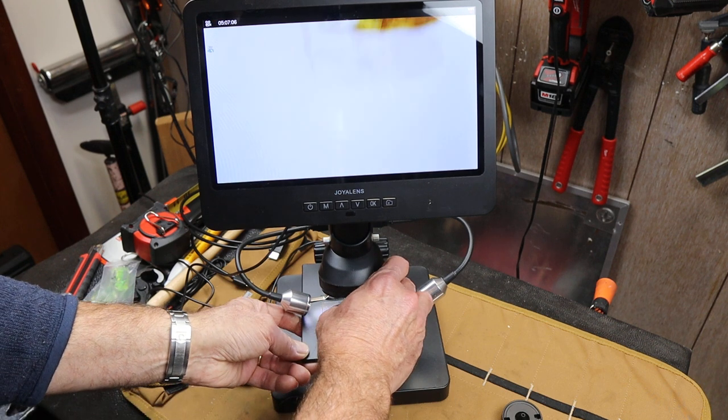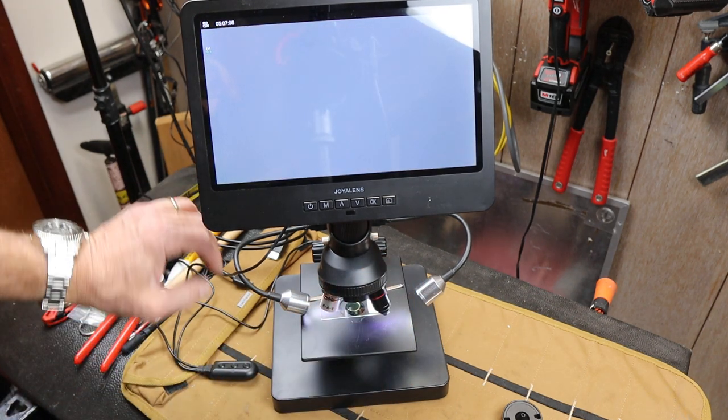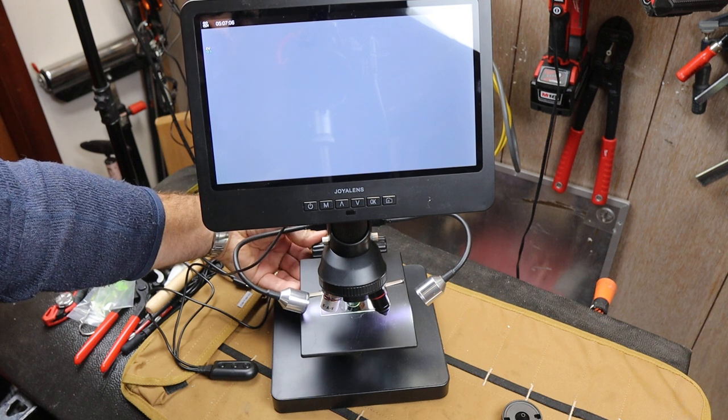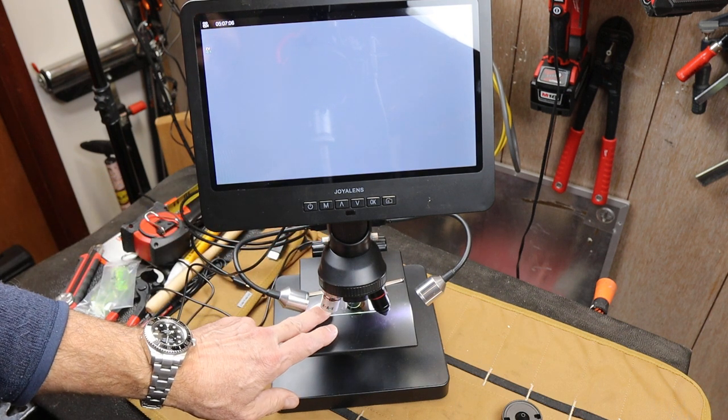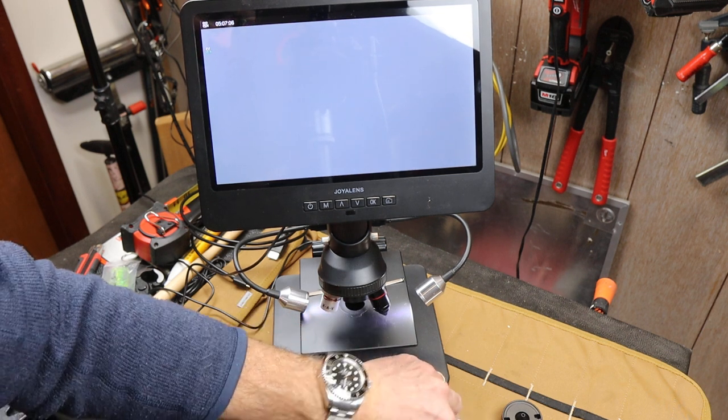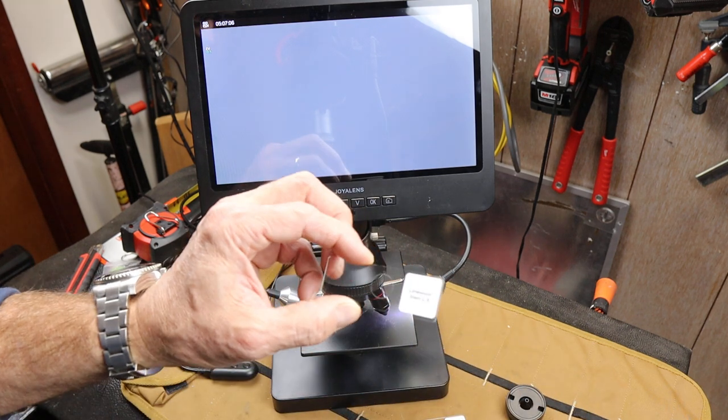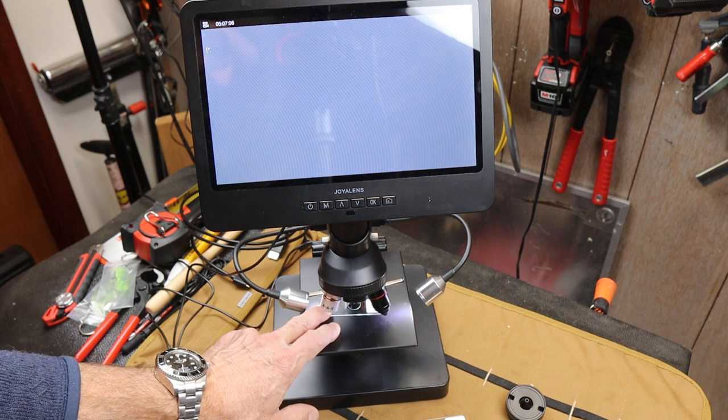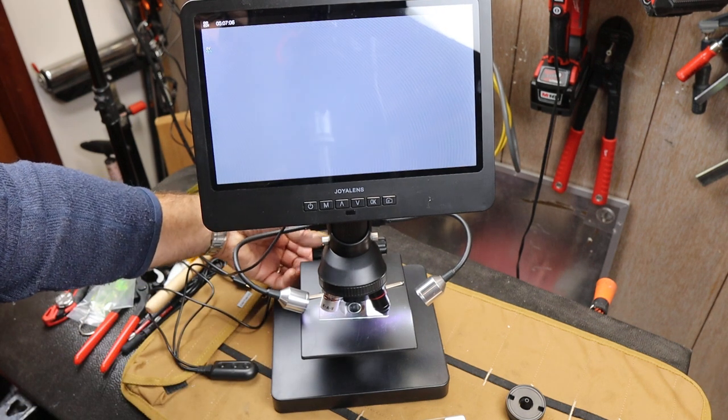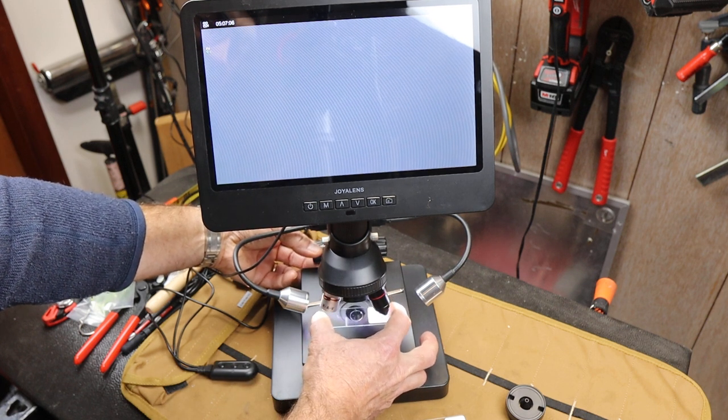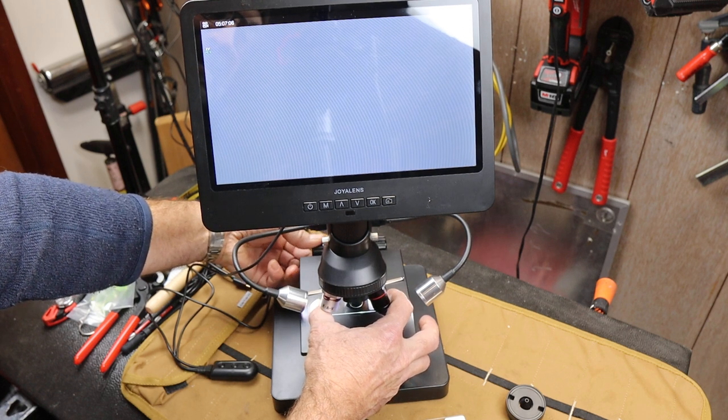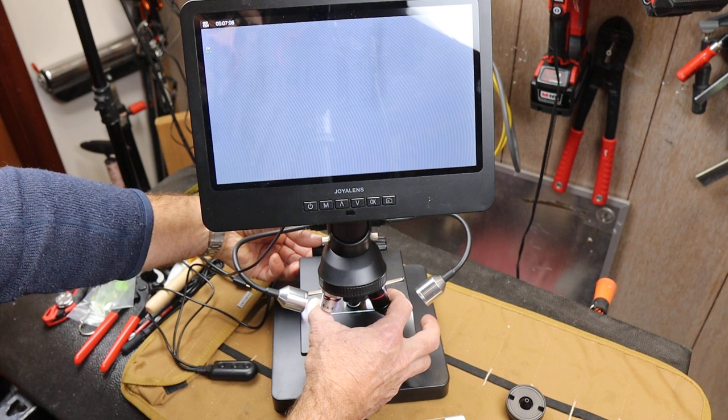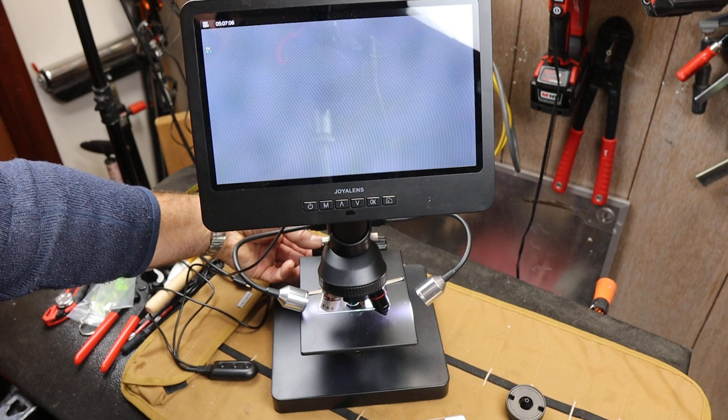I can crank it up again by rotating this. And then, trying to find wherever my ant parts are. Sometimes these things, in fact, I'm going to switch to something a little easier target. Here's a lime wood stem. Throw that on there. And then, where am I, there should be in here somewhere.